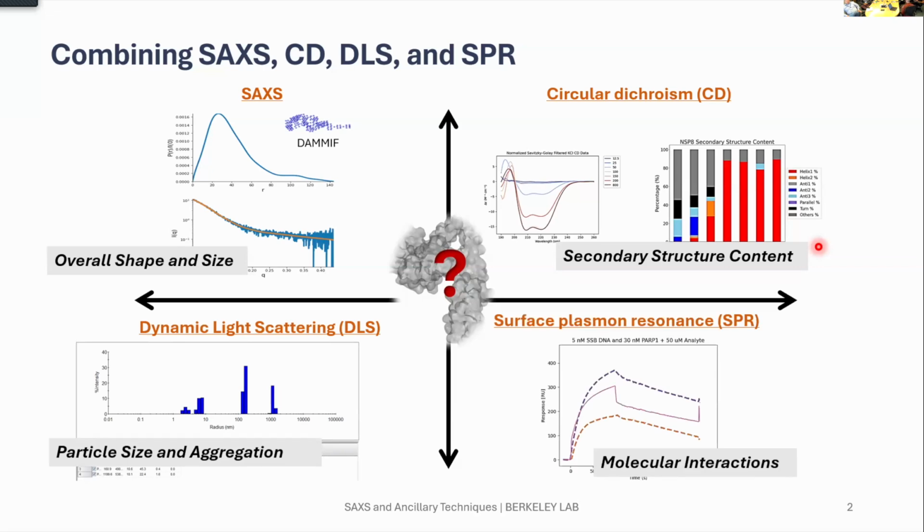And finally, surface plasmon resonance can show us how those molecules interact with each other, what the kinetics of those interactions are. So basically, these are the outlines of my talk today, and I'm just trying to show some data that I obtained for some of those experiments and show how we can combine those techniques.